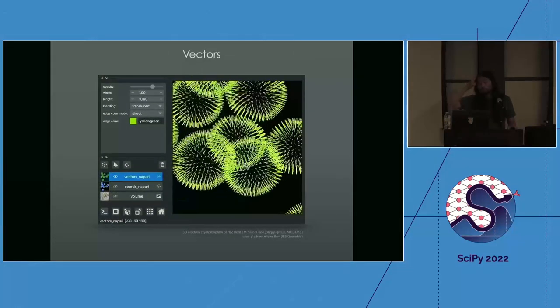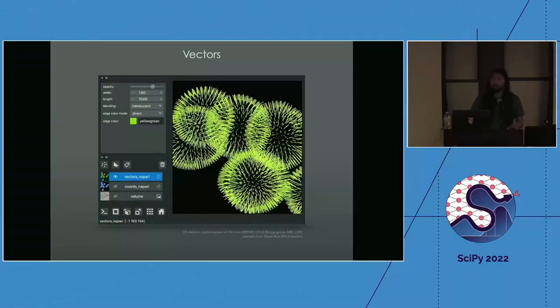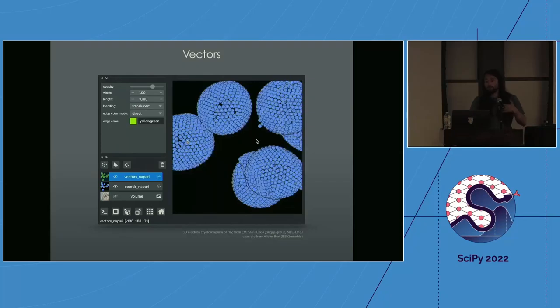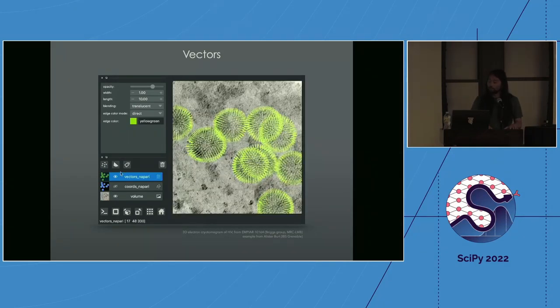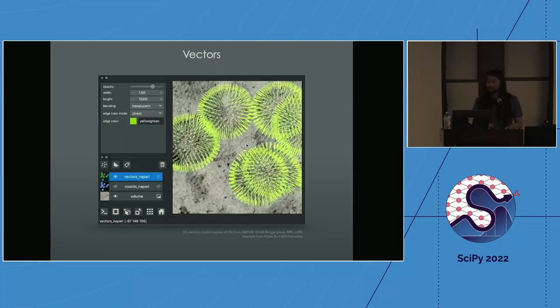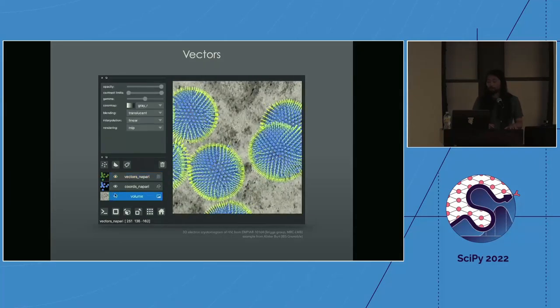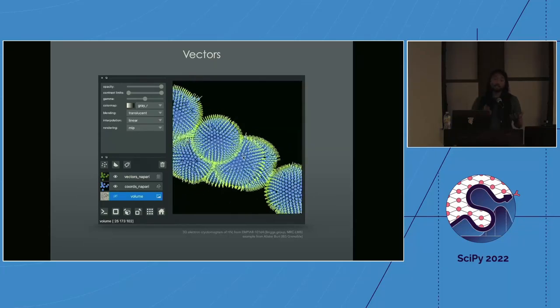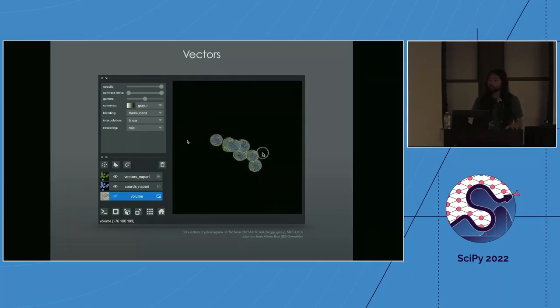We also have a layer for depicting vector data — great for showing orientations of fields. If you do electromagnetism, it's a great way to show field lines. This example shows the orientation of different receptors on viral particles. People also use this in mechanics to show stress fields or strain fields.